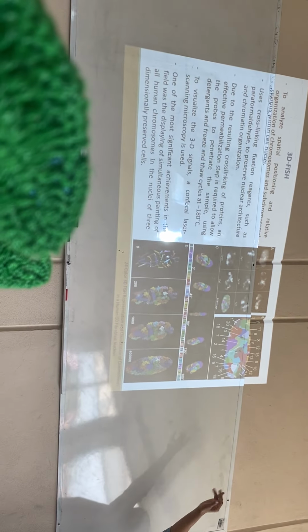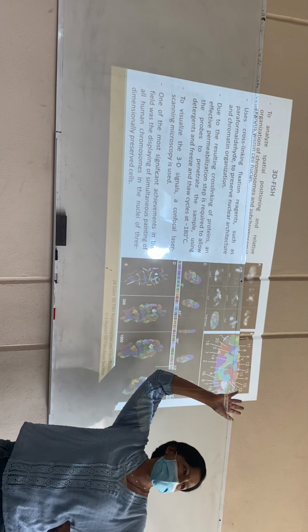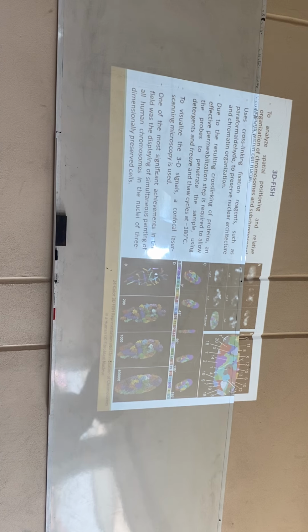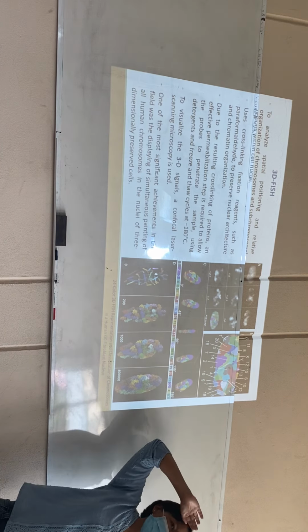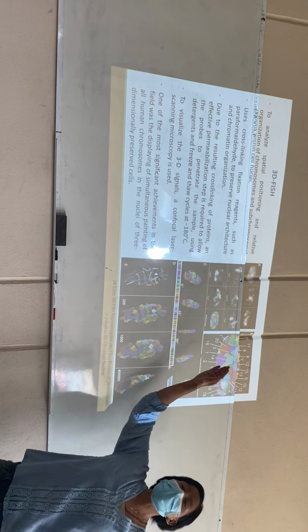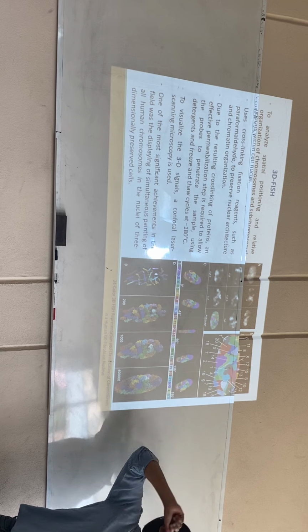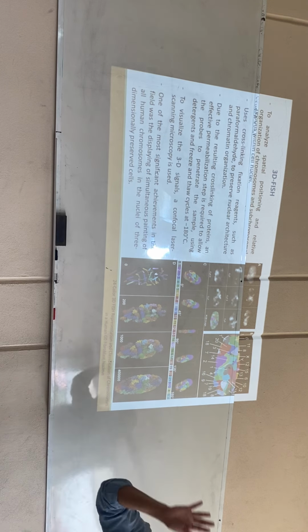Question. Perfect. So basically, what we have here is a three-dimensional image of FISH, meaning that we were using fluorescent labeled probes to localize the different structures that are chromosomes, but the chromosomes were identified in 3 dimensions. So basically, it's exactly the same.